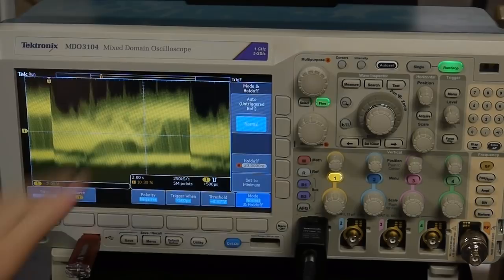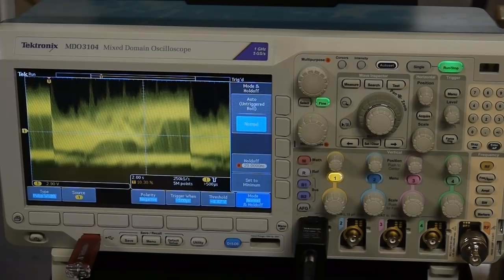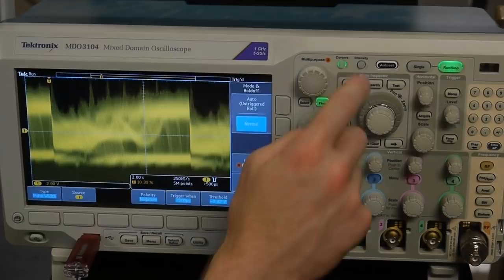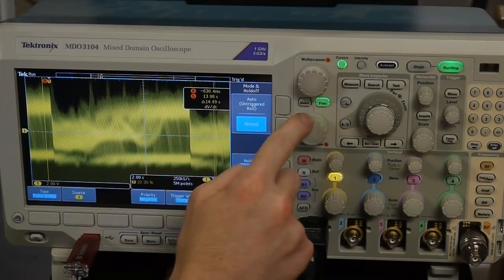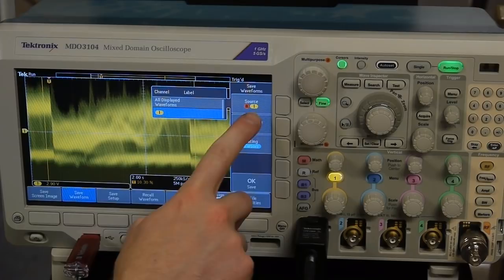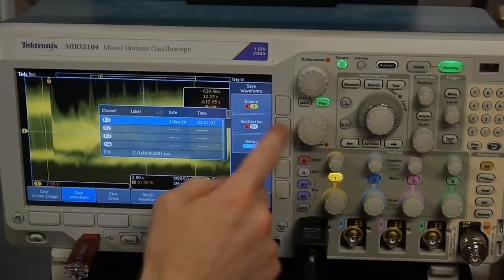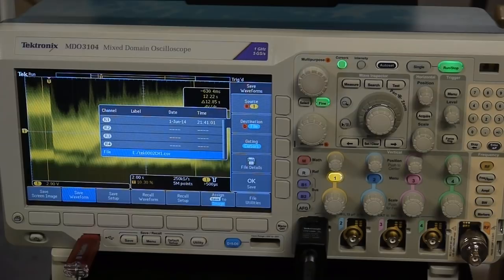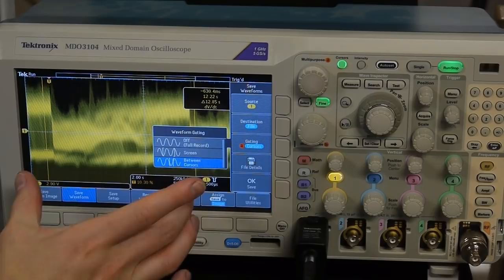So now we want to save this data to a file that we can get onto a PC. So I'm going to use my USB drive here. And the Tektronix has an interesting feature. What we can do is set up the cursors to just select the data that we want. So I'm going to basically give it some buffer, but basically just select that frame. And then we'll go to the Save menu and say Save Waveform. We're going to save Channel 1. And instead of saving it to a reference waveform, we're going to save it to a file. And for gating, we'll say Between Cursors. So we could have it save just the screen or the full record, but this will actually save us some data since we don't care about the other frames.